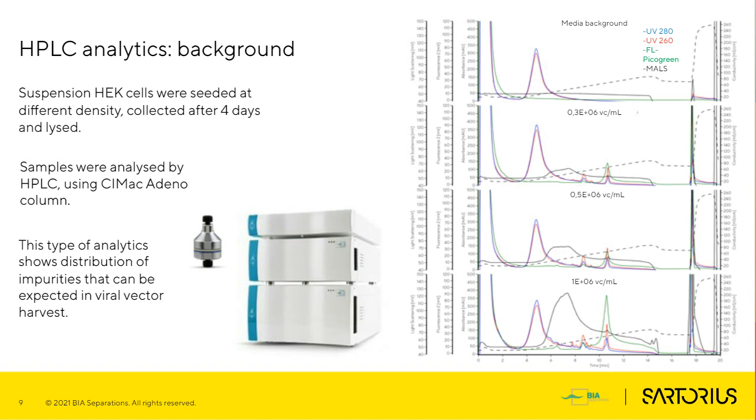And once a certain quantity of DNA has been bound to the column during the loading, it is possible that the rest of the DNA was not able to get the same strength of binding to the column and hence gets eluted during the salt gradient. And this could be the reason why we start seeing the peak here.